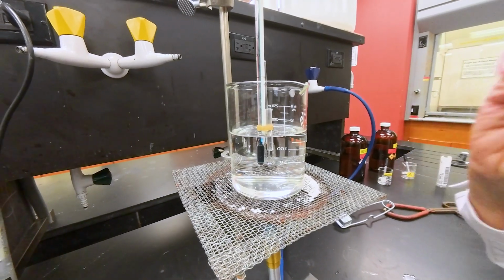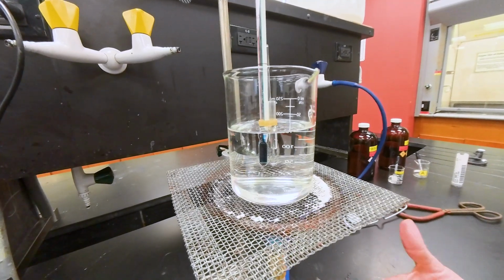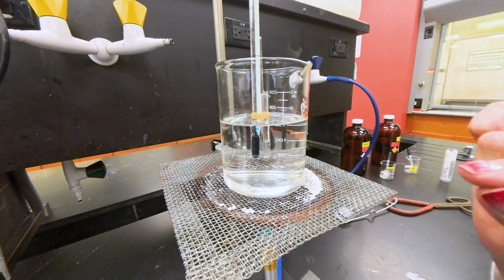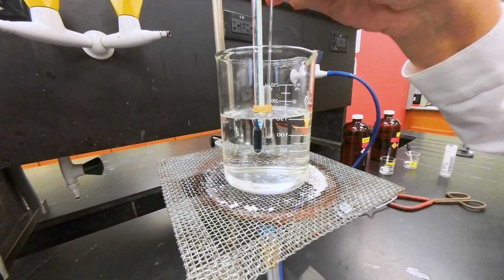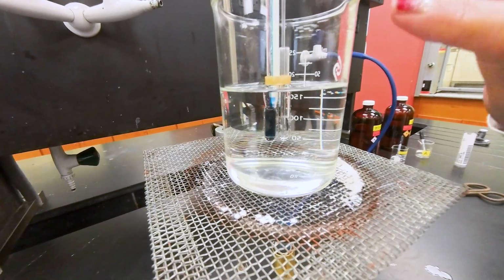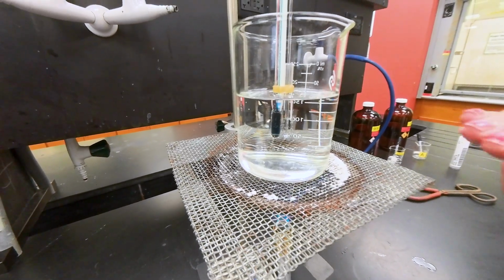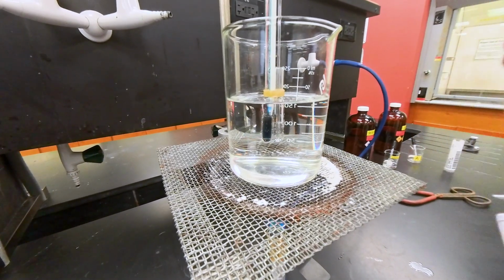When it comes out very fast, the temperature of the water is close to the boiling point but higher than the boiling point. At that point, I'm going to stop the heat, turn off or remove the Bunsen burner, and wait until the bubbles stop coming out and the liquid goes back into the capillary tube. Because first, when I place the capillary tube in, the liquid goes inside the capillary tube. When it changes to gas, it comes out. Then when I turn off the heat and the temperature drops to exactly the boiling point, the liquid is going to go back up in the capillary tube.